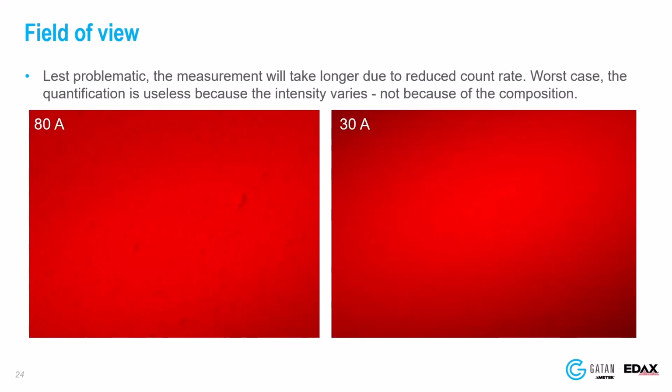Apex will warn you if the magnification setting is too low and guides you towards higher magnification settings. Nevertheless, it's important to understand which magnification range each crystal has and to apply them correctly. So how do we strategically combine EDS and WDS?